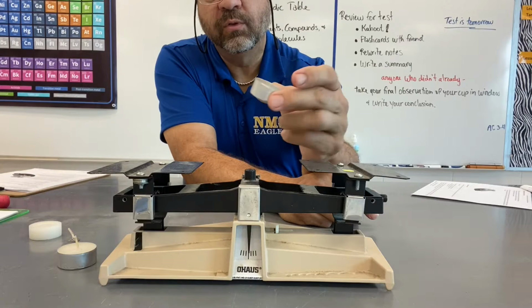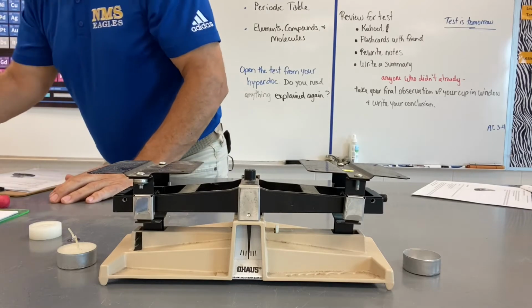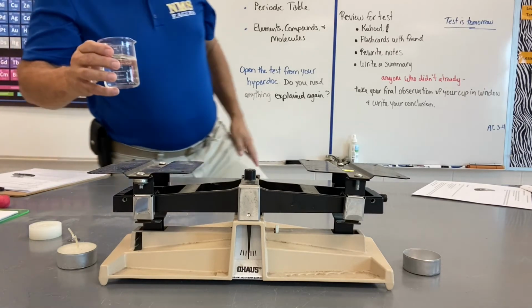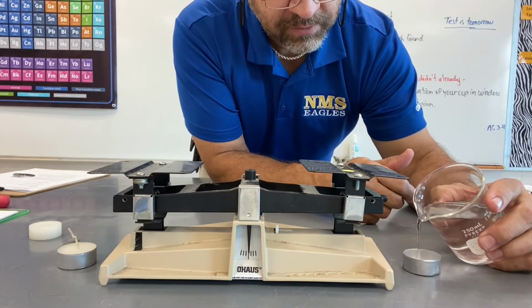I'm going to fill that cup with water. Thought I left and went home, didn't you? All right, so here we go. Fill in this little cup with water here. Hopefully I won't be making a big mess.